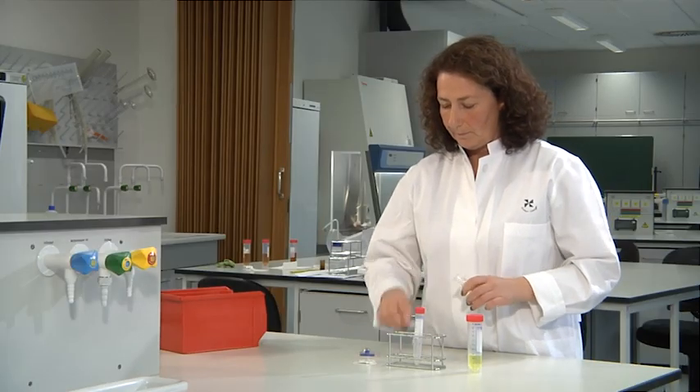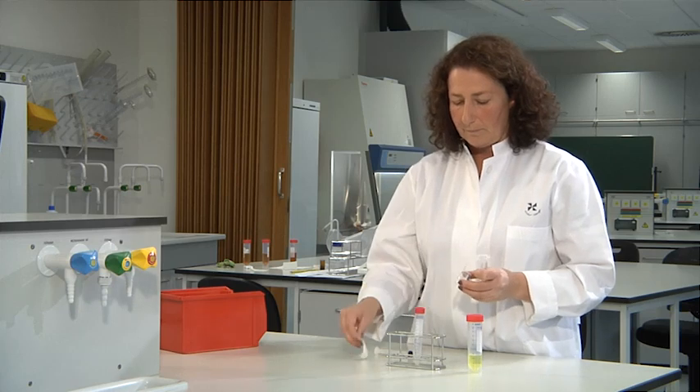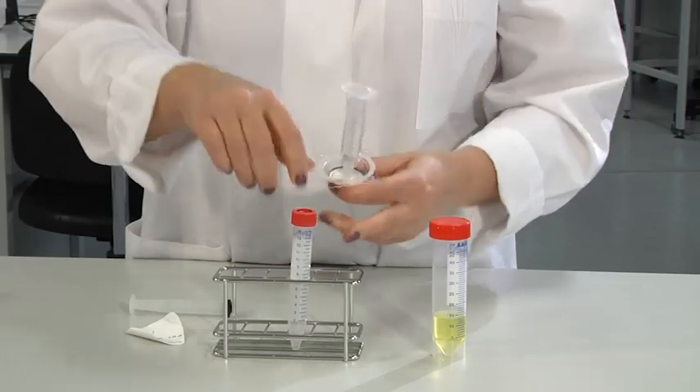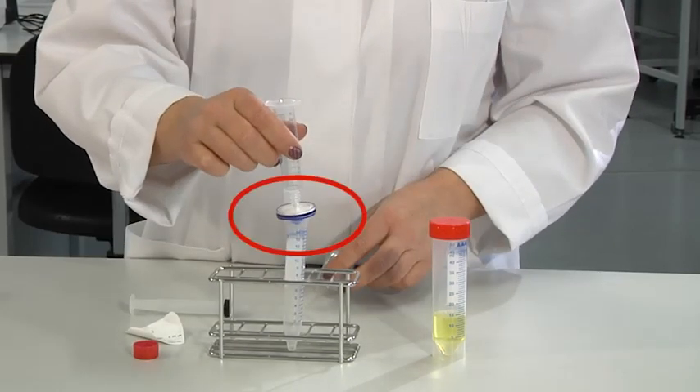Heat labile compounds must be sterile filtered in order to remove microbial contamination. A sterile, single-use, 0.2 micrometer pore filter is connected to a syringe. Be aware that the blue side of the filter should not be contaminated. The syringe does not necessarily need to be sterile.